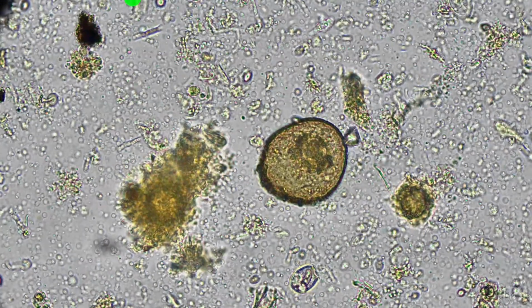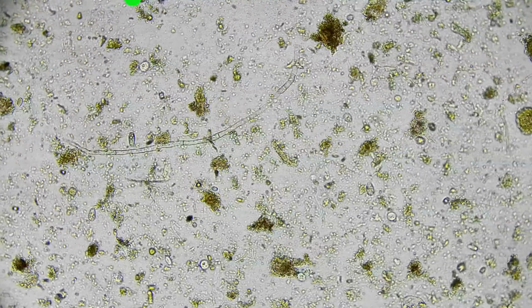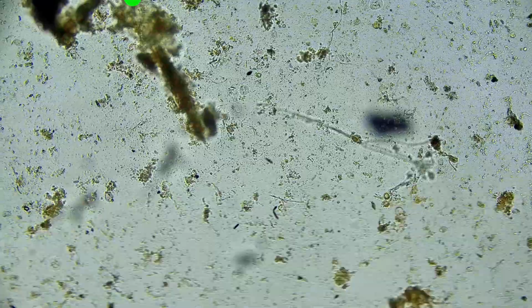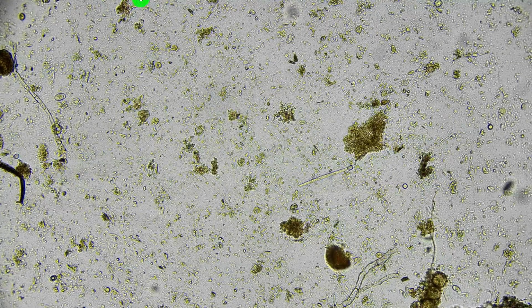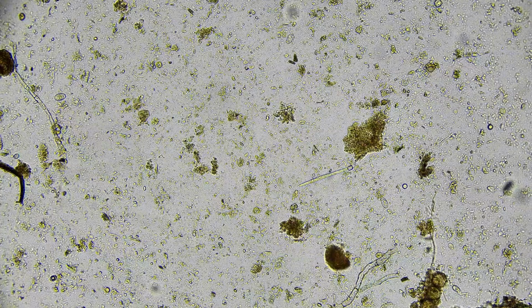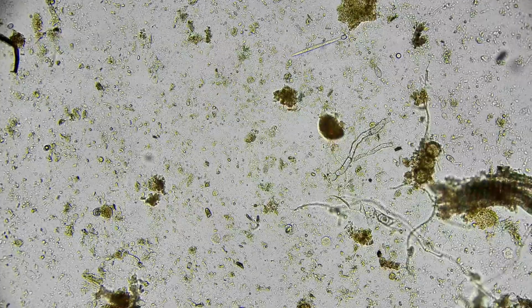This is another large Arcella. I keep going back. So again, this is a huge slide too. I can be here for days. I really can. There's another nematode right there. There's another. I don't know what that is. I can't tell you this.